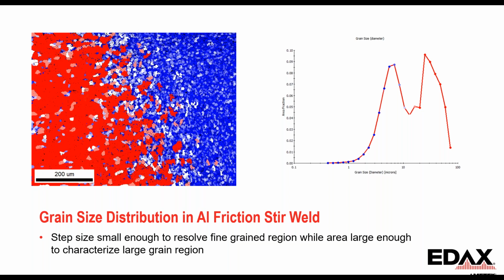We could crop and partition out things that we want, but we're able to more fully understand, or at least fully visualize, the microstructural transition across this weld zone.